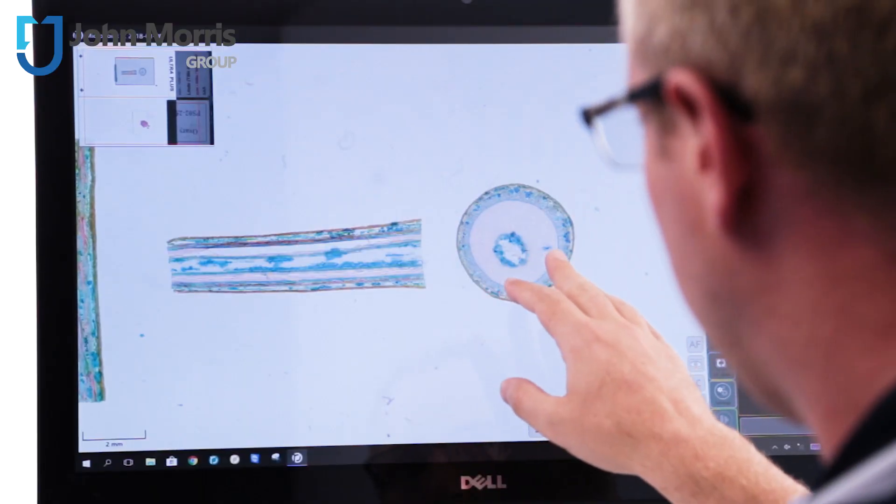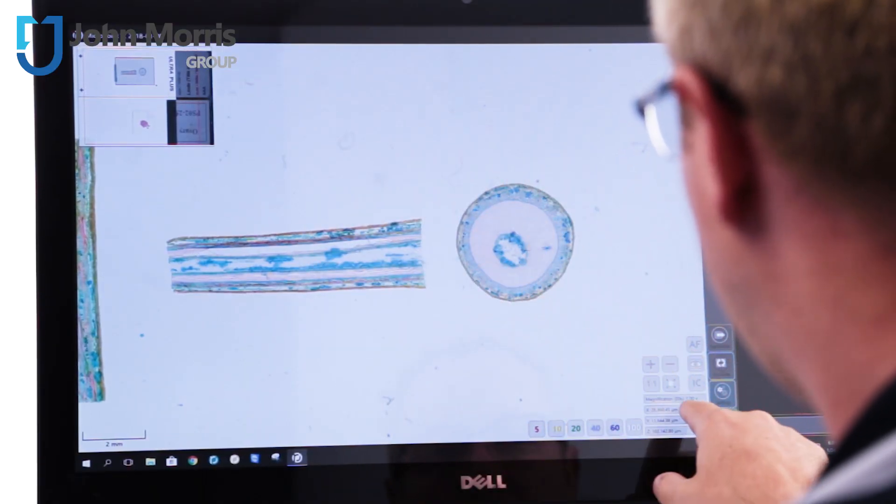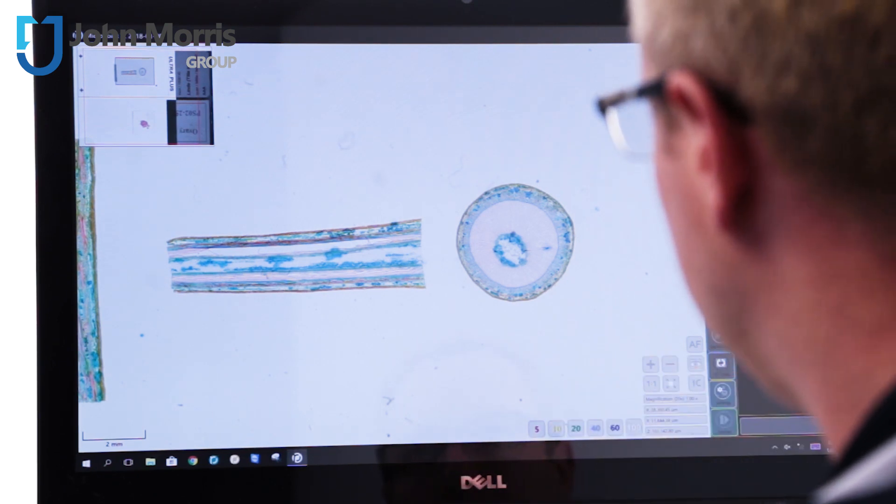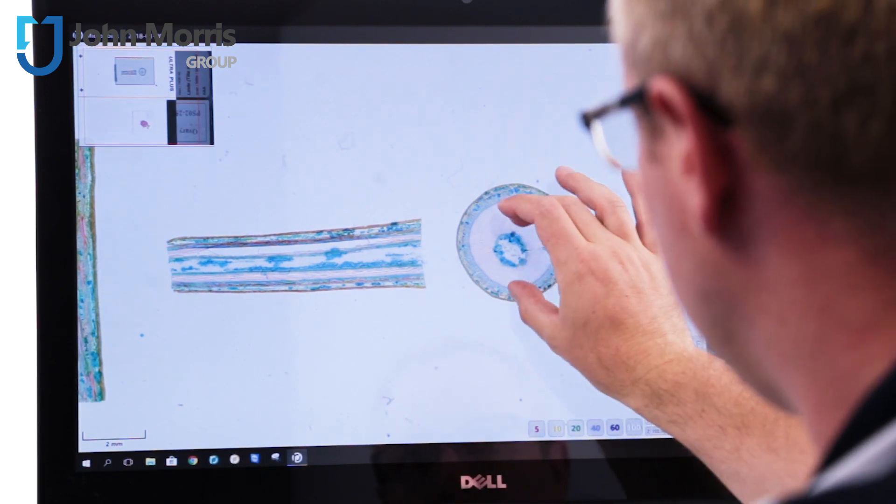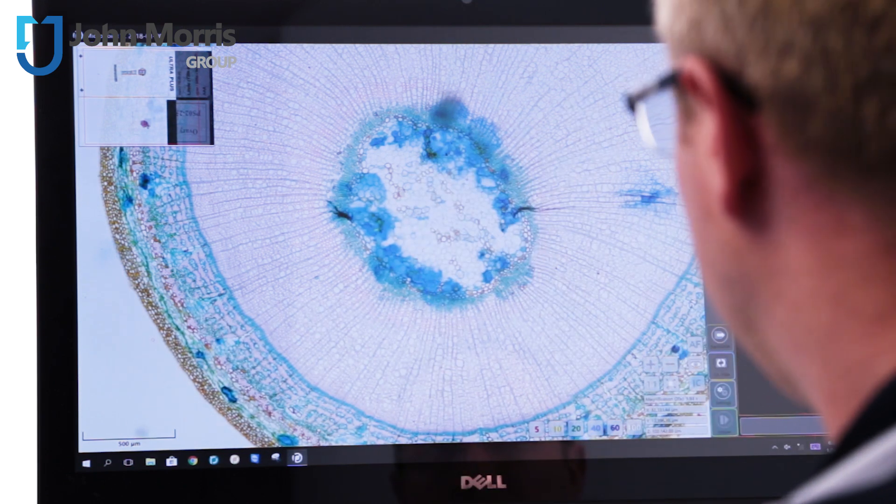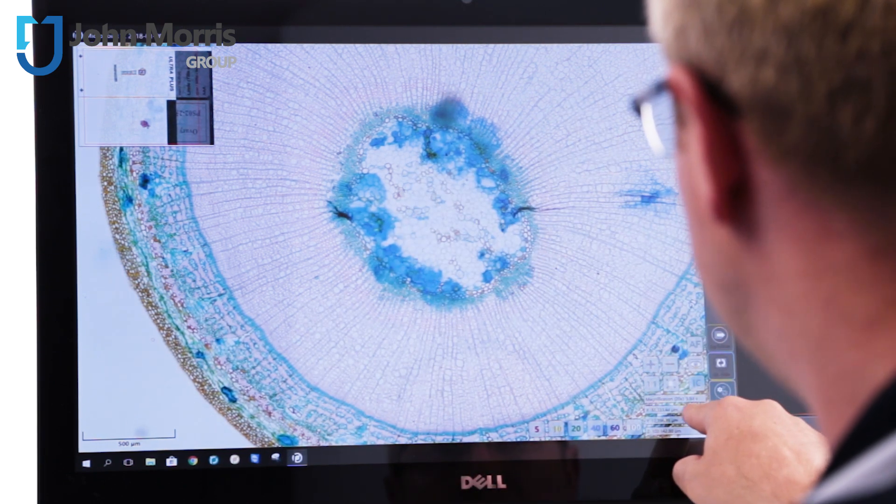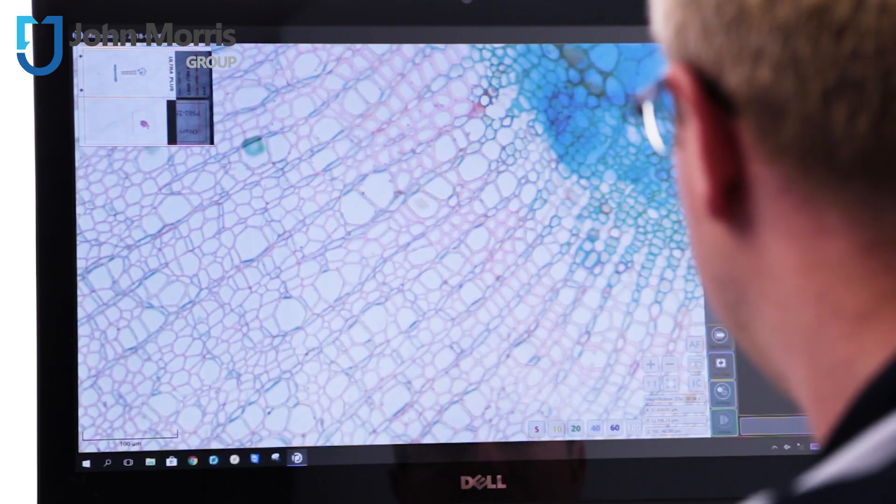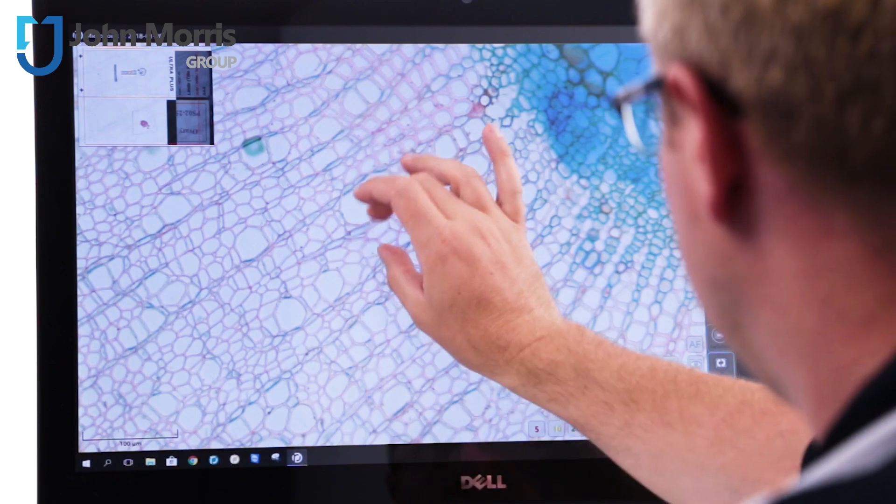Here on the screen what we have is a cross-section of a plant sample and I'm currently sitting at 1x magnification on a 20x objective. So what I'm going to do here is zoom in and you can see how quick this is and it will automatically refocus for me. I'm currently now at almost 6x, 5.93, and if I wanted to zoom in a little bit further I can. There I'm at 30 and I can zoom in a little bit further again. Now I'm at 119 times that objective of 20 times.